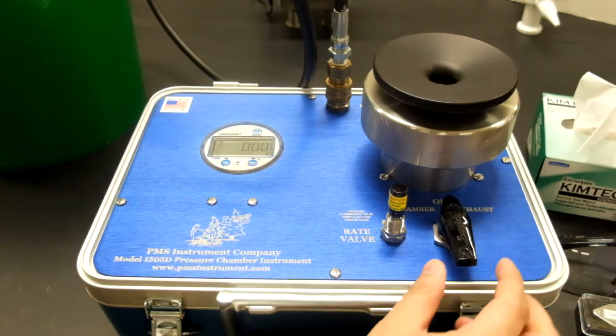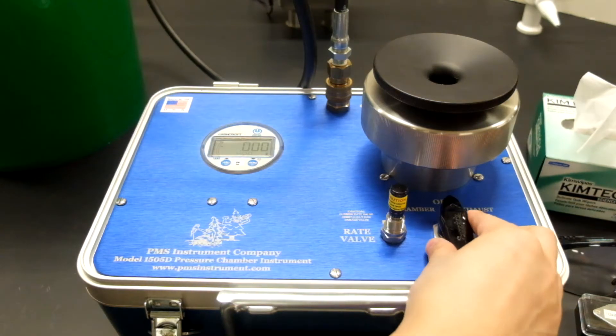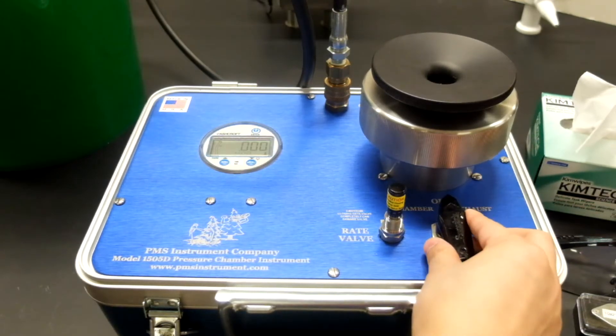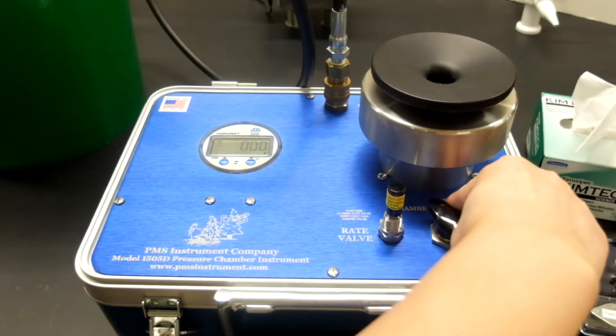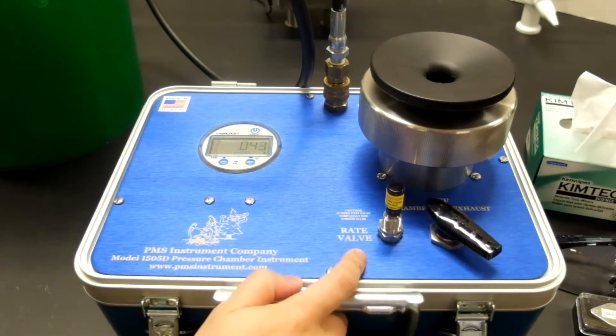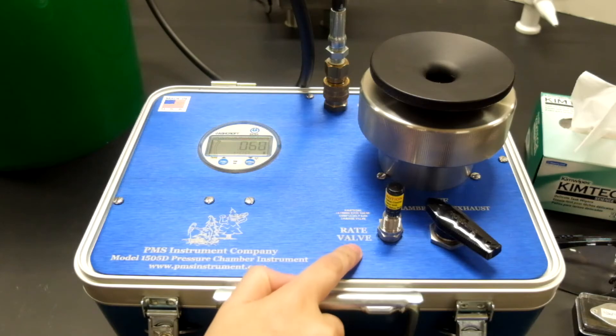To begin measurement we will then turn the valve on the right into the chamber position. Upon this nitrogen gas will fill the chamber. We can adjust the rate of the nitrogen to the chamber by adjusting the rate valve if needed.